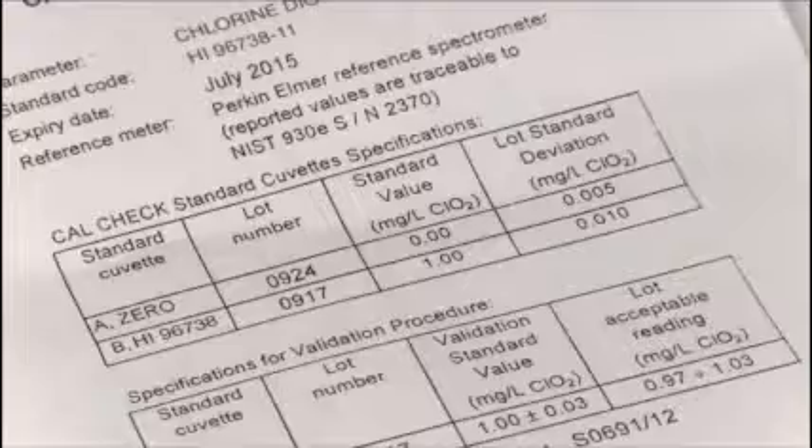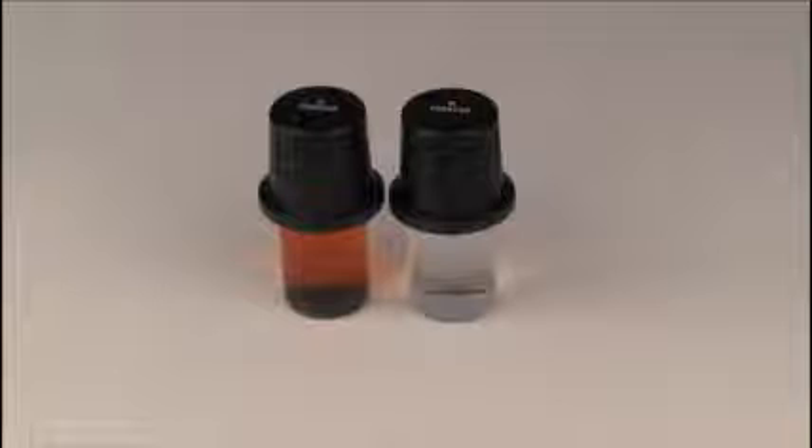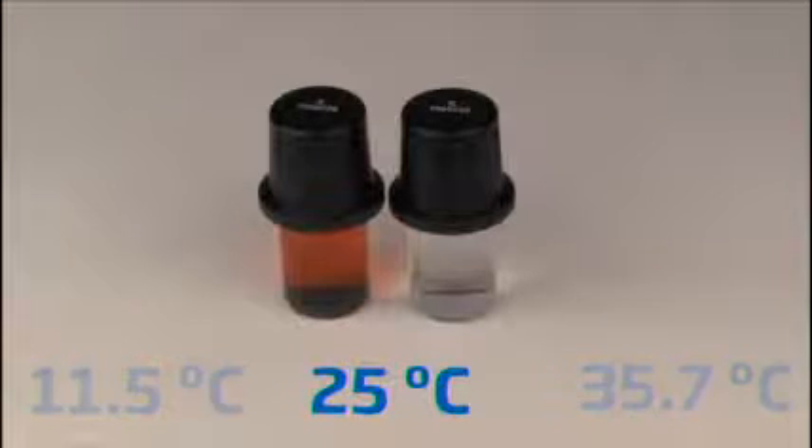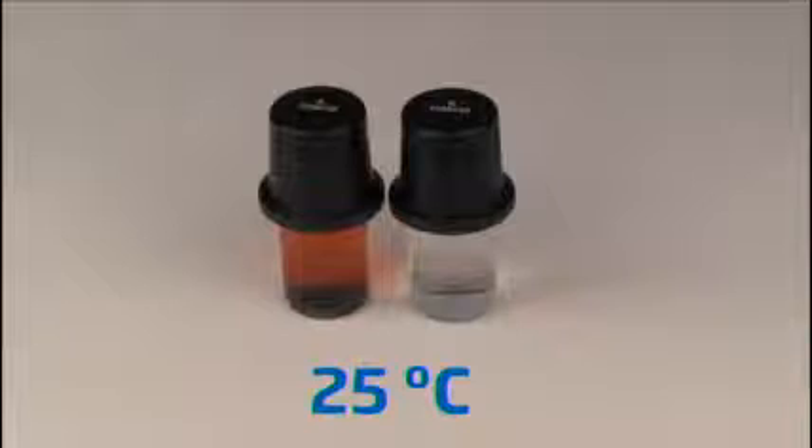CalCheck standards are certified at 25 degrees Celsius, and as the temperature varies, so will the obtained value. The further the temperature of the CalCheck standard is from 25 degrees Celsius, the less accurate the calibration check standards become. When performing a calibration check, care should be taken to ensure the standards are as close to 25 degrees Celsius as possible.